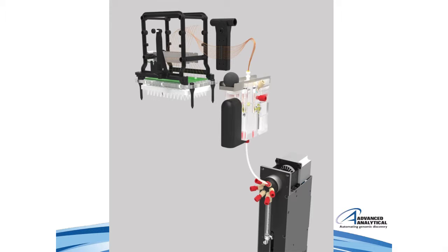Once the gel is loaded into the capillaries, the nucleic acids are precisely and consistently injected using a highly controlled process called electrokinetic injection. On the Fragment Analyzer, both the time and the voltage of the electrokinetic injection can be controlled if desired. Once the separation starts, every sample runs through its own capillary, meaning that no one sample will ever affect the run of another sample. This is unlike lab-on-a-chip methods, where a previous sample could affect another sample simply because there's only one separation column.